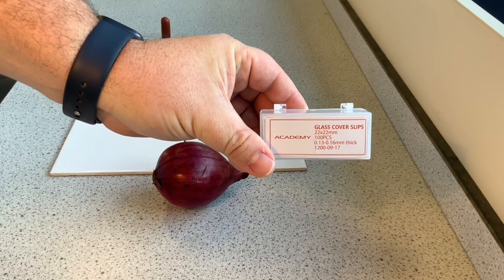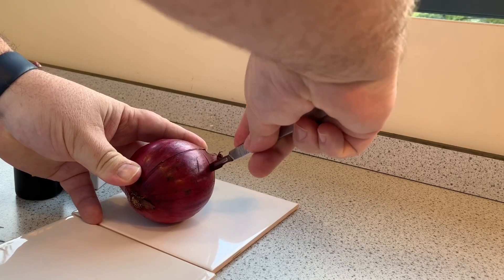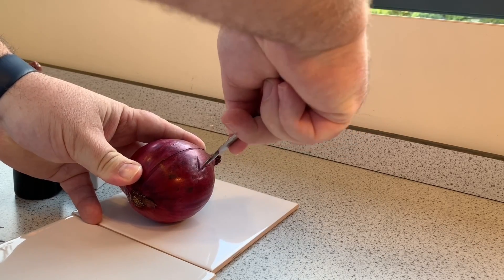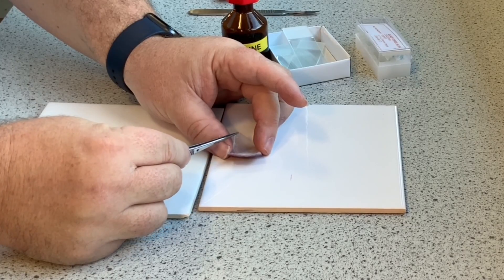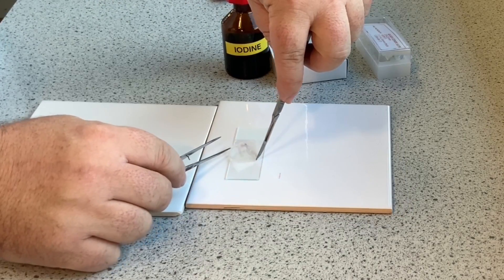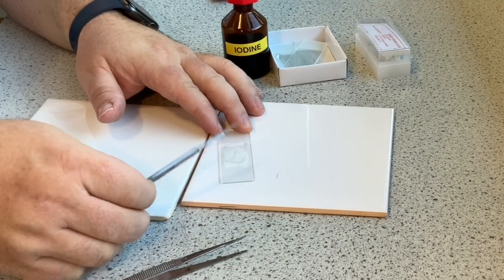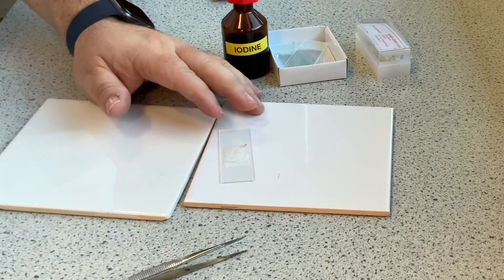You'll also need to use glass cover slips to put on top of your specimen. Using a scalpel, carefully cut a section out of your onion skin. Once you've got a piece of onion skin, using a pair of tweezers, gently pull away a sheet of onion cells. Gently smooth the sheet of onion cells onto the slide, being careful not to get fingerprints all over the slide.